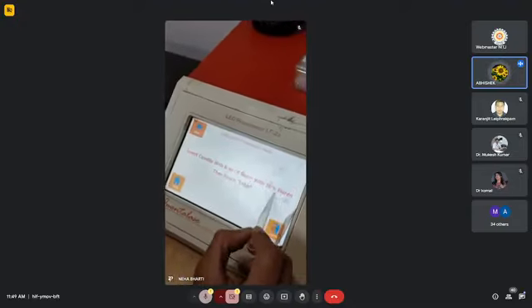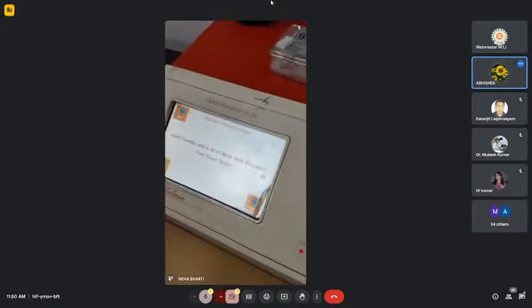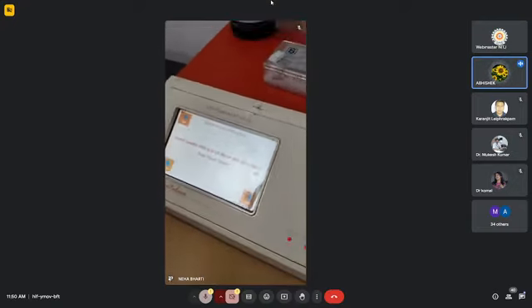This is the first step for the calibration of the instrument, and it involves the measurement of uranium in a blank solution, so that if there is any impurity in the water we are using, it can be subtracted from the measurements. So now we are adding 6 ml of water.